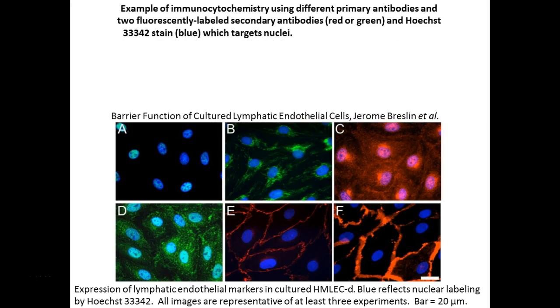So this is an example of where they've used antibodies that have been tagged with fluorescent dyes to stain slides. And so the antibodies are binding to specific things in those cells. So you'll see that the protein they were looking at, this green one, is stretched out throughout these cells on the inside. You can see this red one is pretty diffuse as well.